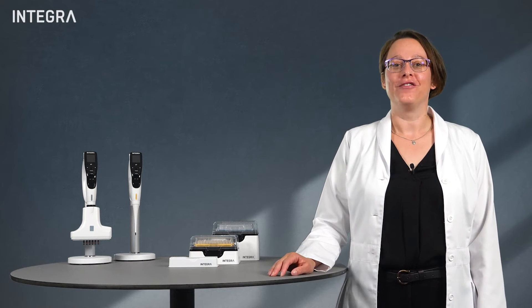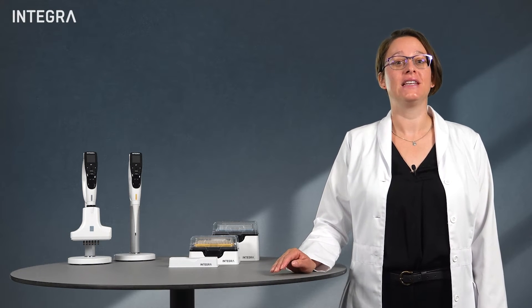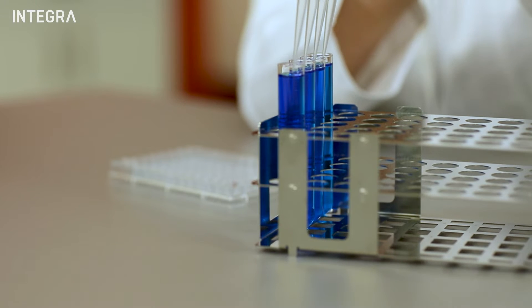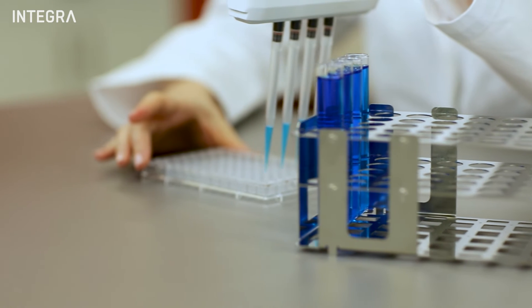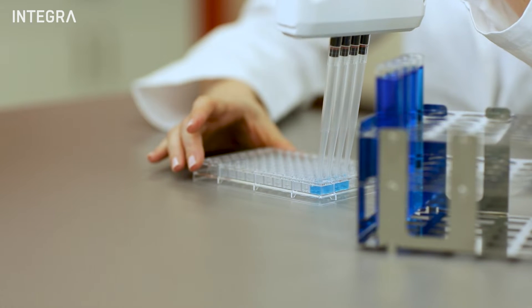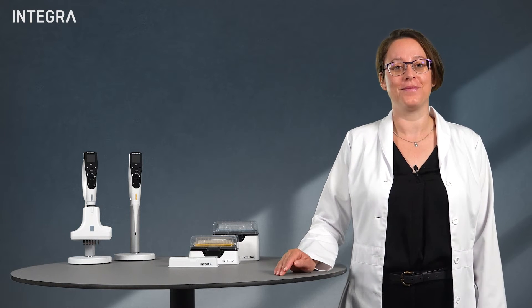Hi there! Volatile liquids, such as ethanol, can prove to be difficult liquids to pipette accurately. They evaporate much faster compared to aqueous solutions, which in turn can often lead to dripping tips, something likely experienced by most people who have ever pipetted with them.